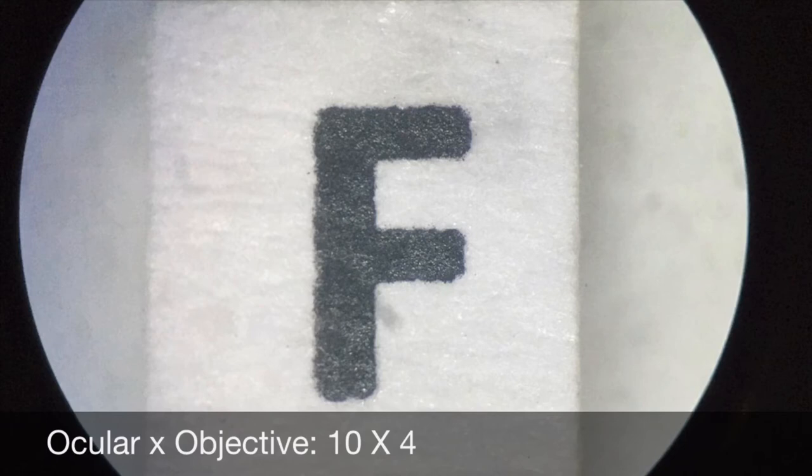Also, explain in words the differences between images observed with the naked eye and under stereomicroscope.